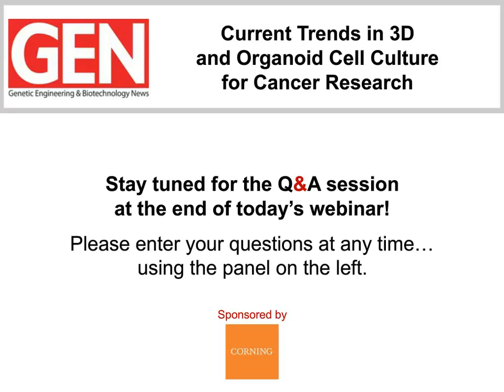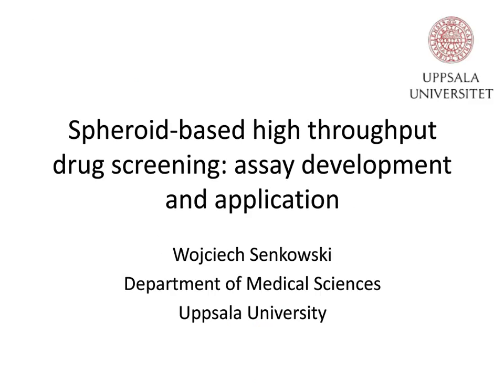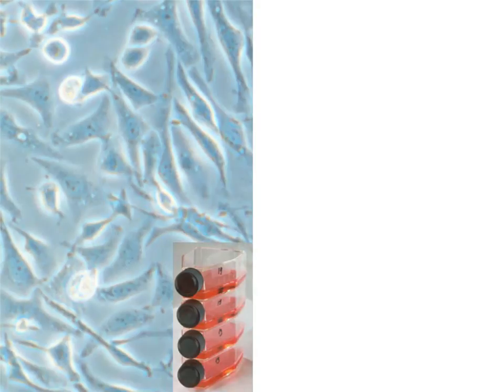Thank you, John, for your kind introduction, and thanks to Corning for inviting me to speak to you today. But right before I jump to high-throughput drug screening assays that we have developed and applied in our lab, let me just ask the question, why would we even need spheroids for high-throughput drug screening? So on the left side, we see a standard monolayer cell culture, the model that is most widely used in cancer research and drug development today.